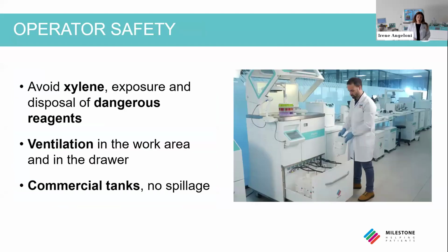Talking about, again, the use of isopropanol, we usually have isopropanol instead of xylene. And this is an important aspect because this reagent, isopropanol, is safer. In terms of exposure and also in terms of disposal of the reagent, the use of isopropanol is safer than other reagents such as xylene that are very toxic.